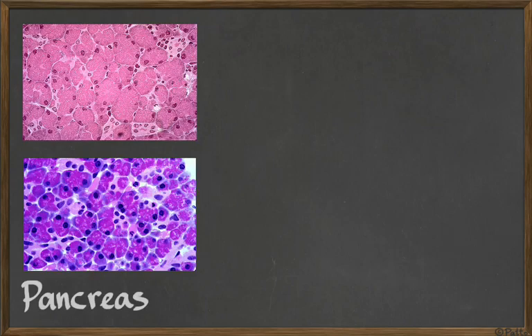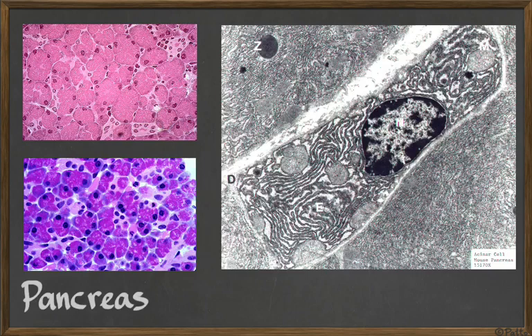So here on the left, we have the pancreas seen in an optical microscope. And here you have those same cells seen in an electron microscope that can magnify it even further. We see that this black and white image on the right has a much bigger magnification and resolution.